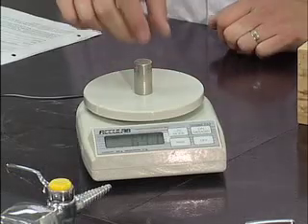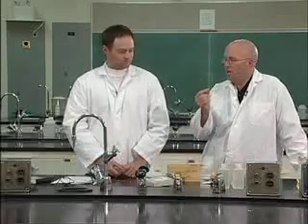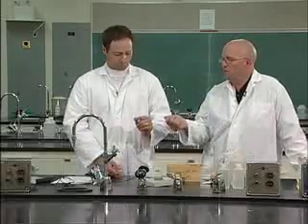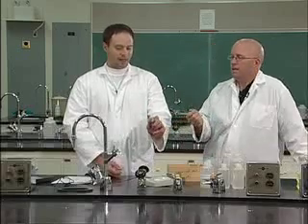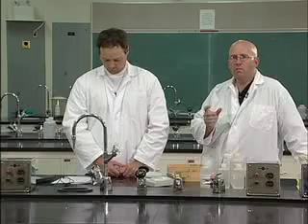Perfect. That was great. That wasn't that bad, was it? Putting something on a scale. Right on. So we have the first part. We have the mass of, what number is that one again? 6 Sn. The 6 Sn. We have the mass of that. Now we have to figure out what the volume of that is.